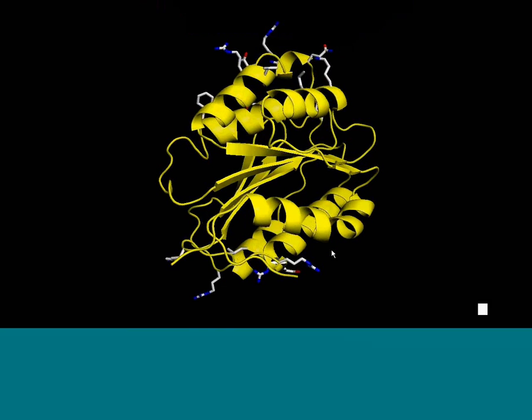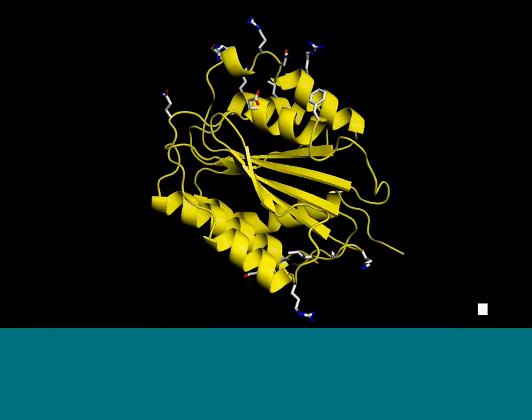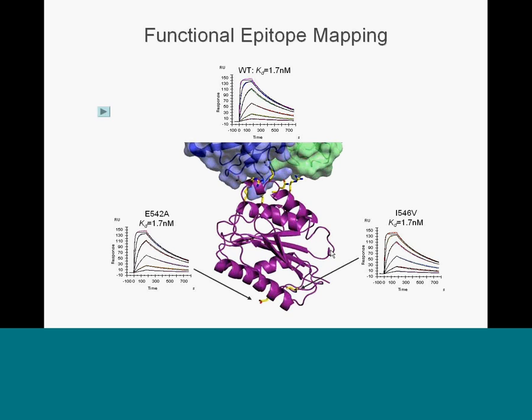And so this represents the 18 different mutations that we generated for these studies. Okay. So the first thing, looking at the controls, if we look at the residues that we mutated that are distal to this binding site, we see that the dissociation constant is of the same magnitude as the wild type. So this is what we would expect because these are not within that interface.